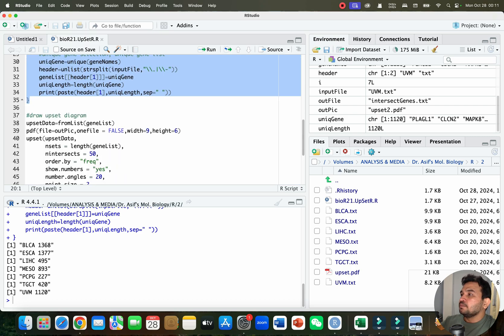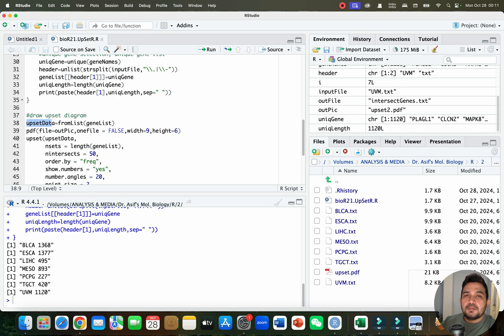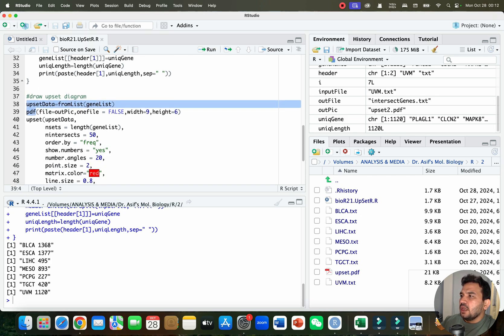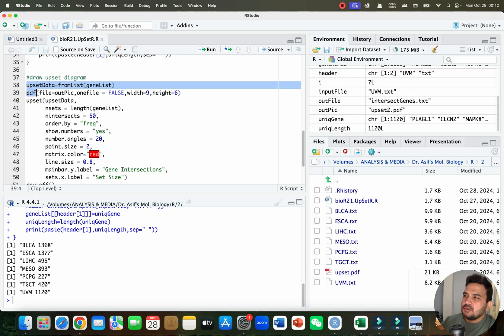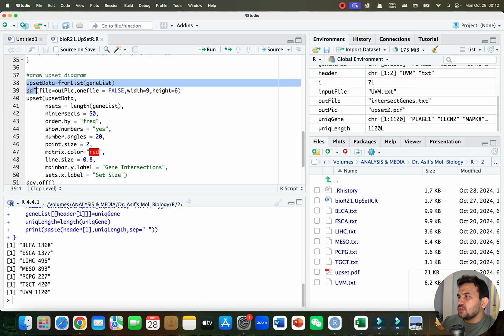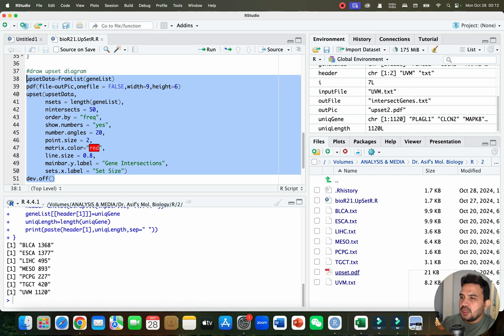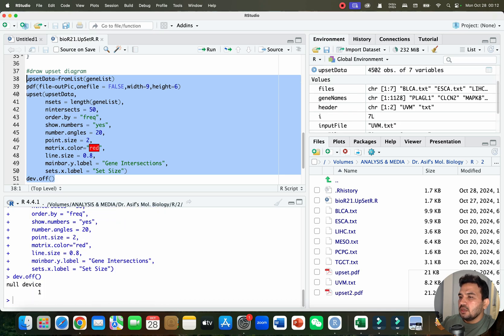Now we need to draw our upset diagram. Here is the code — 'upset_data' is equal to 'fromList', using the gene list we just created. We can select all this code together and arrange the sorting, show numbers, select the size and point size, and also change the color. If you don't want to customize, you can go with the default code. I will select all and run — you can see our new file 'upset_data2' has appeared.